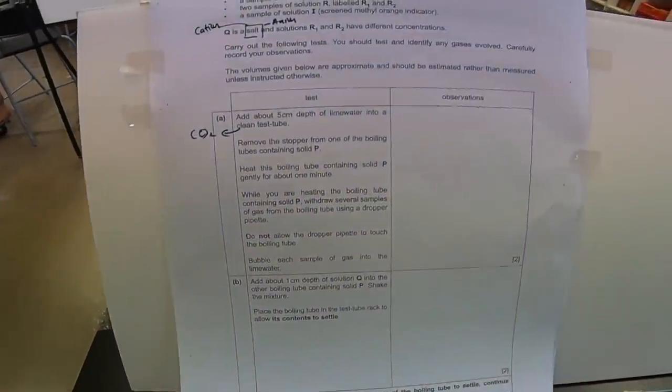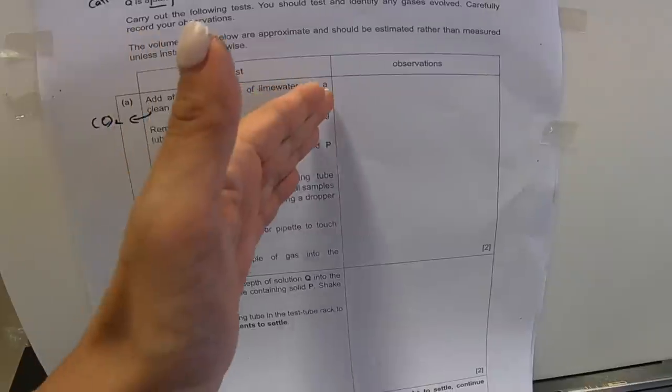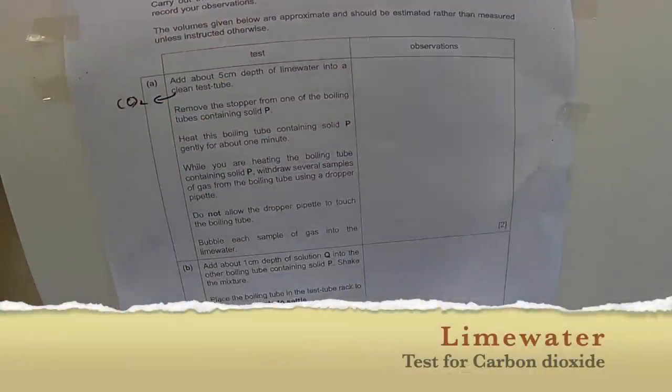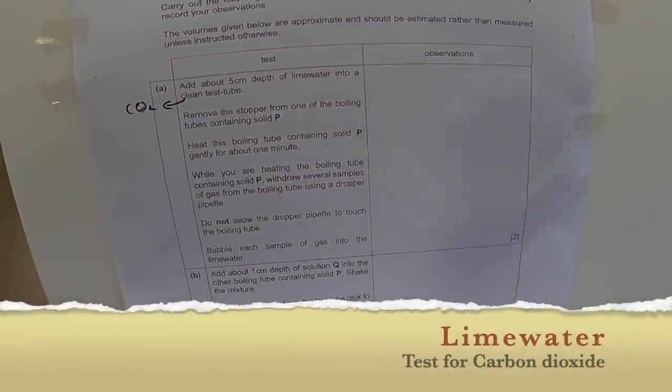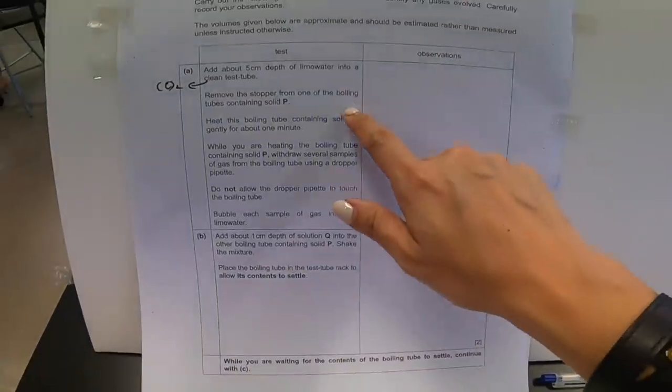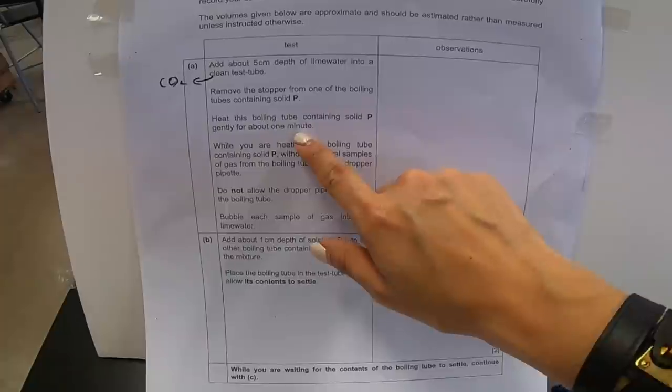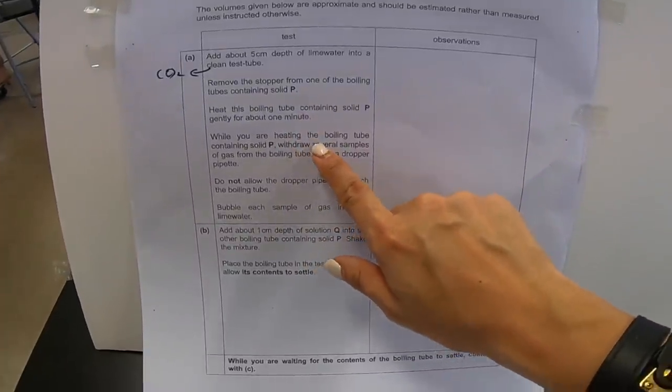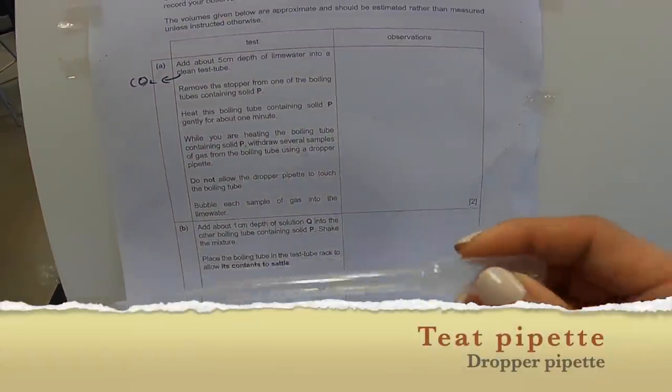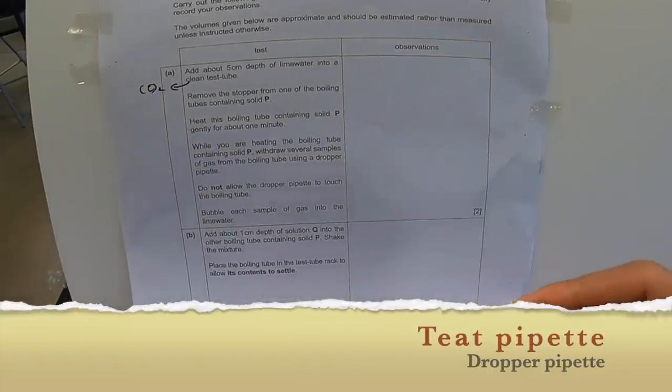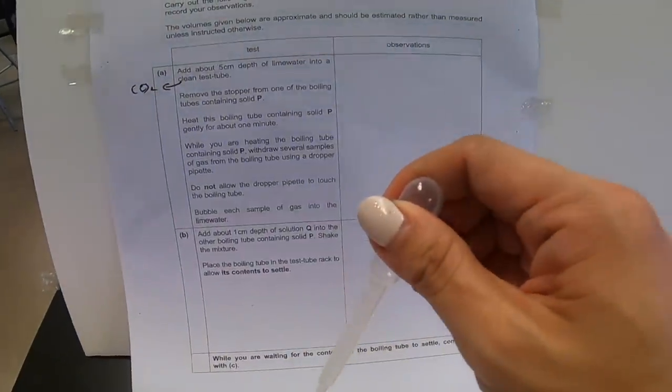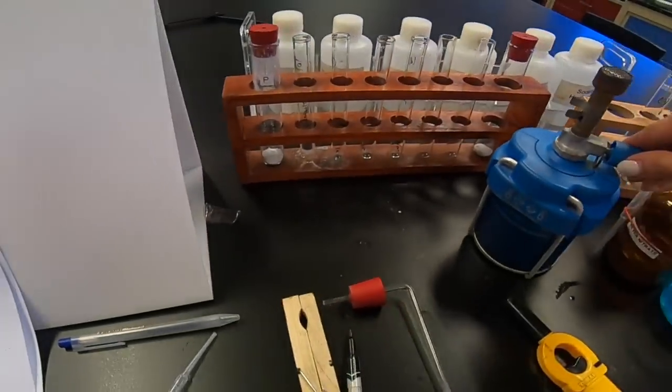Let's begin the execution. First part says that add about 5 cm depth of lime water into a clean test tube. We have already done that in the previous part. Second, they say remove the stopper from one of the boiling tube containing P. We're supposed to heat this boiling tube for about a minute. Let's begin.